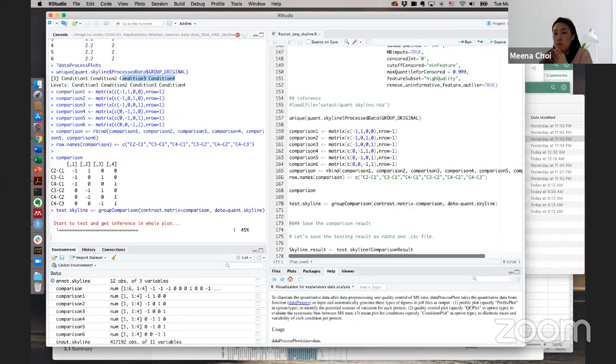However, statistically, if there is no value at all in one condition versus some value in the other, we cannot apply the same linear mixed models. In that case, we cannot report log fold changes. If you really want to find these, there are other methods, such as a G test based on counts, which is a different statistical method for this kind of category. In our model, we cannot do this.